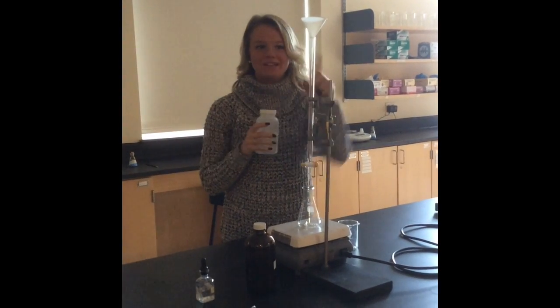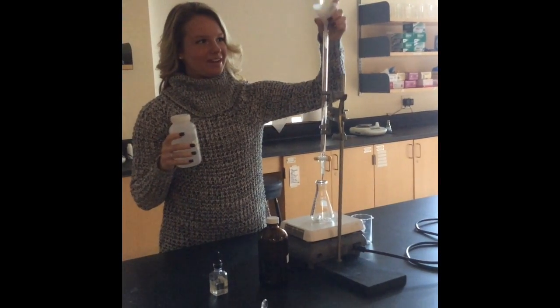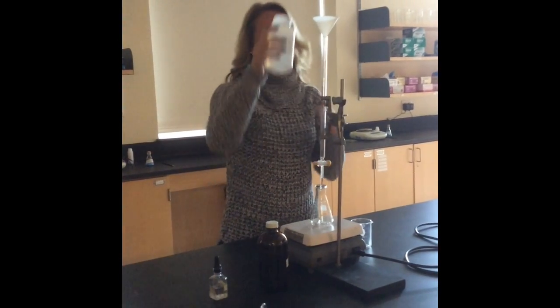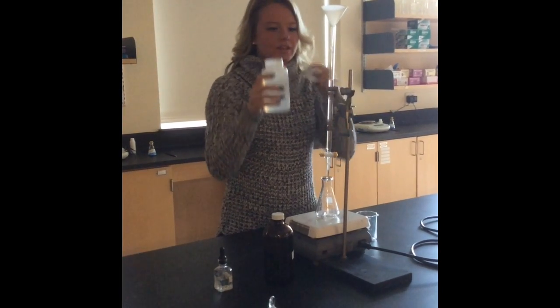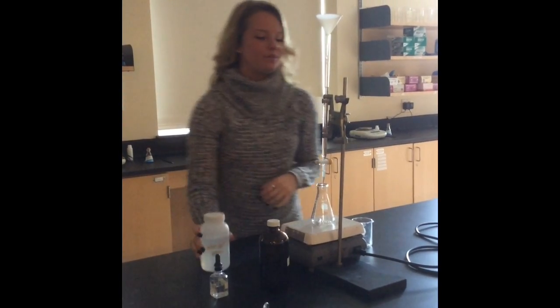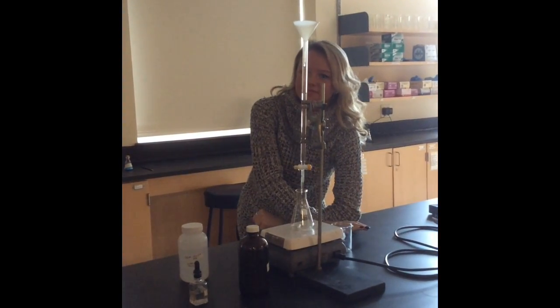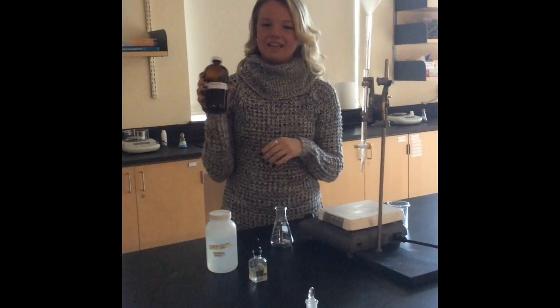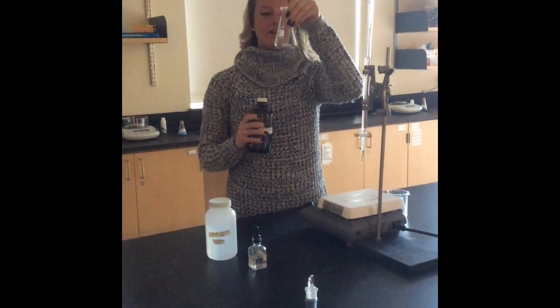NaOH, our base, will be inserted into the burette. This funnel might be a helpful tool to insert the liquid in. When you pour it in, make sure you know your initial volume and your final volume after the titration. Our acid, HCl, will be poured into the Erlenmeyer flask. Make sure your stirring rod is placed on the bottom.